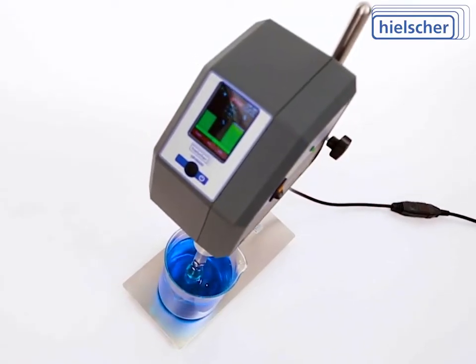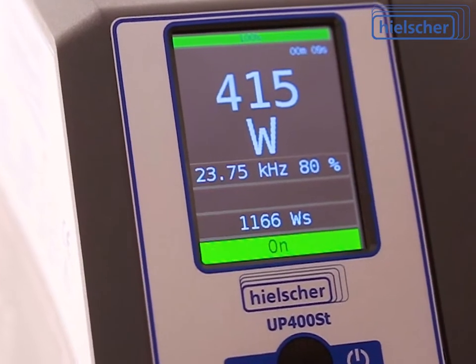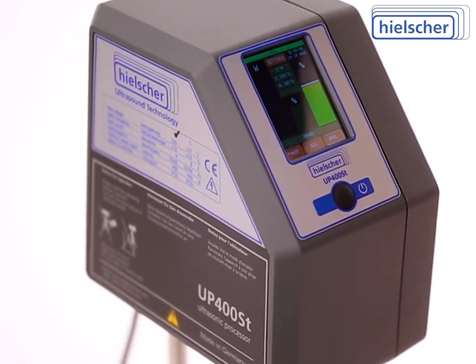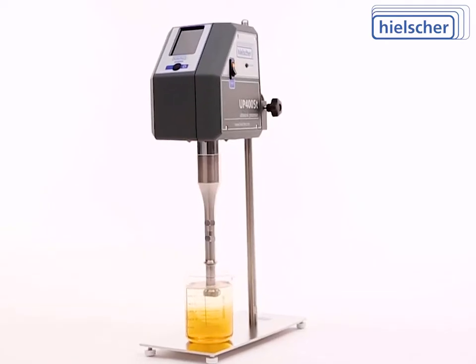The modern touchscreen control gives you access to the state-of-the-art features of the UP400ST, including the precise setting of amplitude, power, pulsation cycles, and temperature monitoring. The UP400ST comes with a built-in timer and a temperature probe.